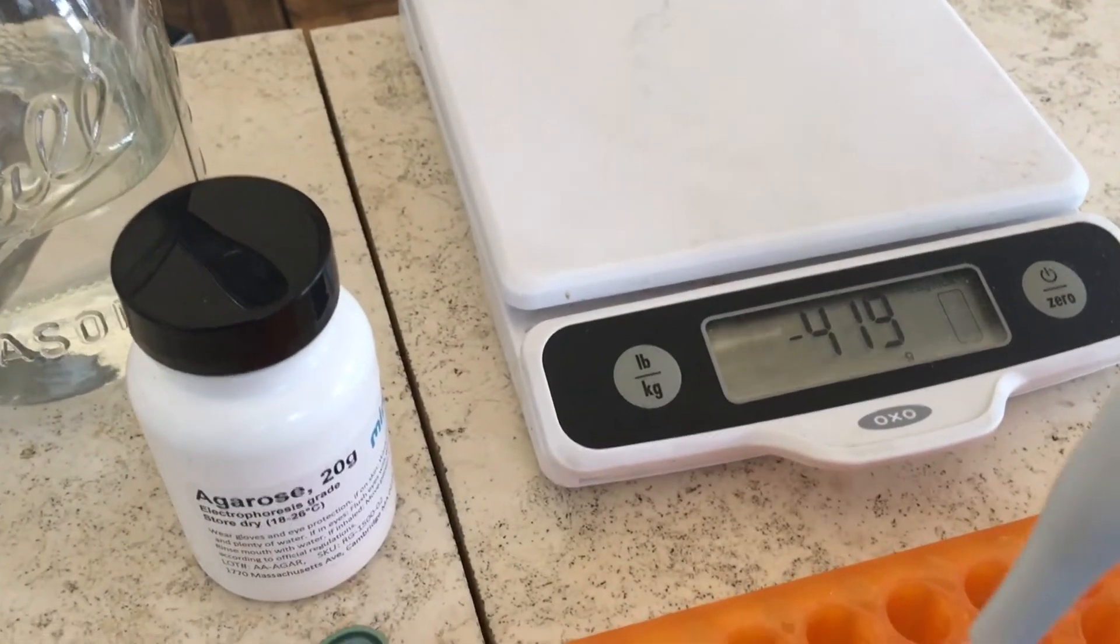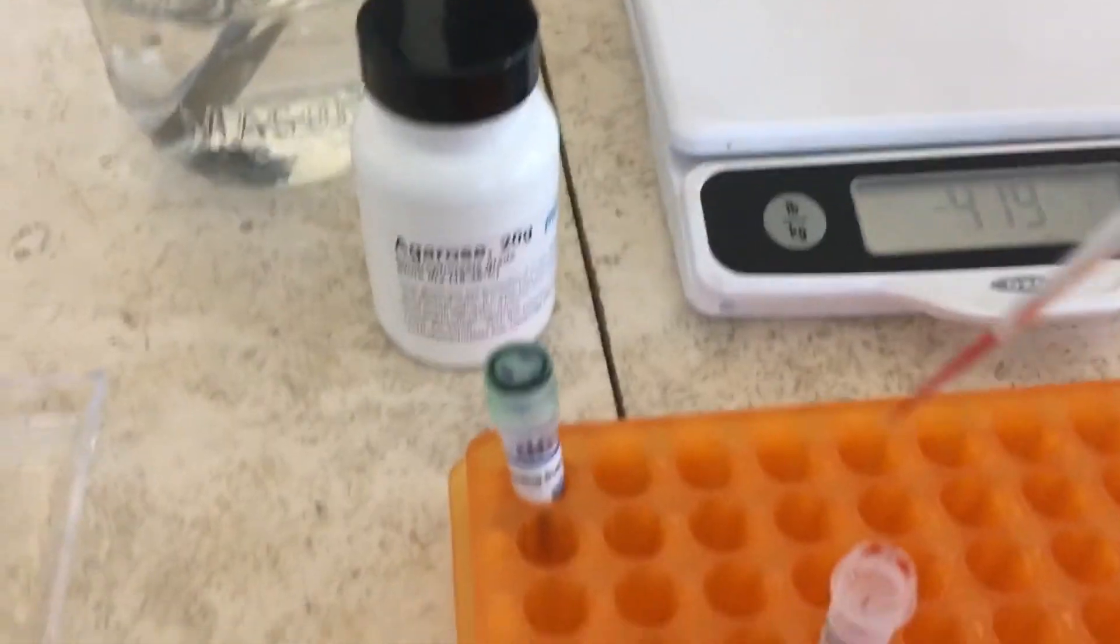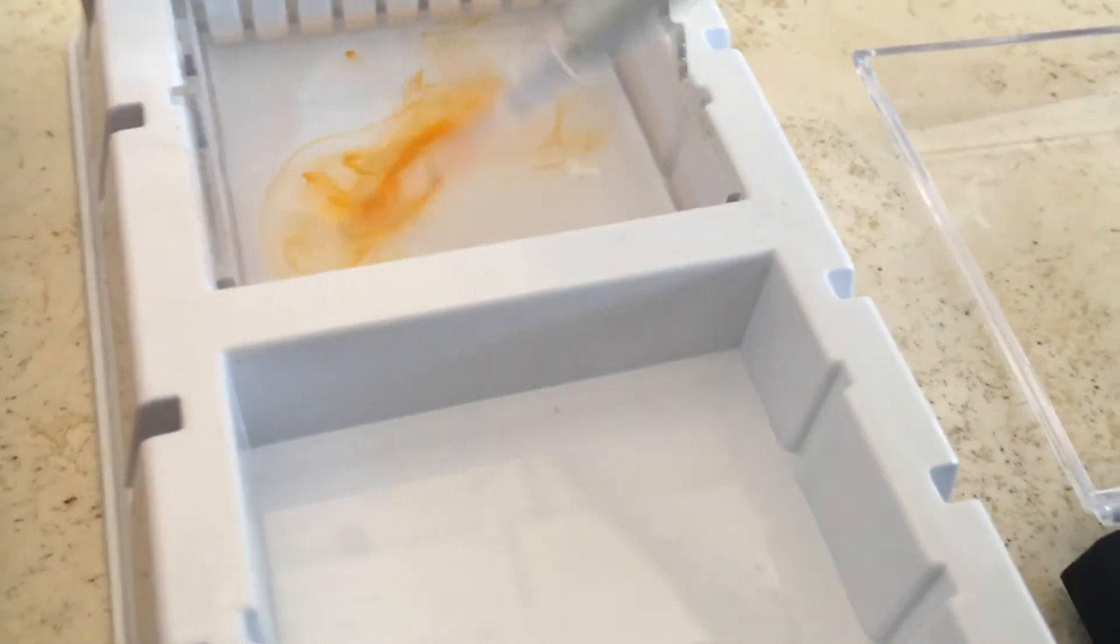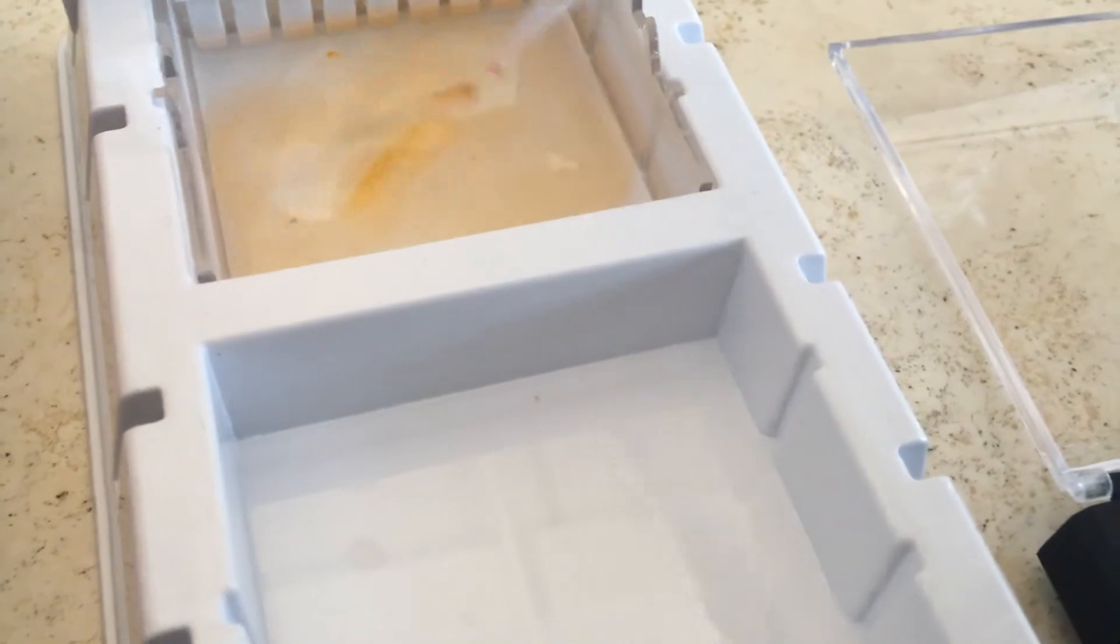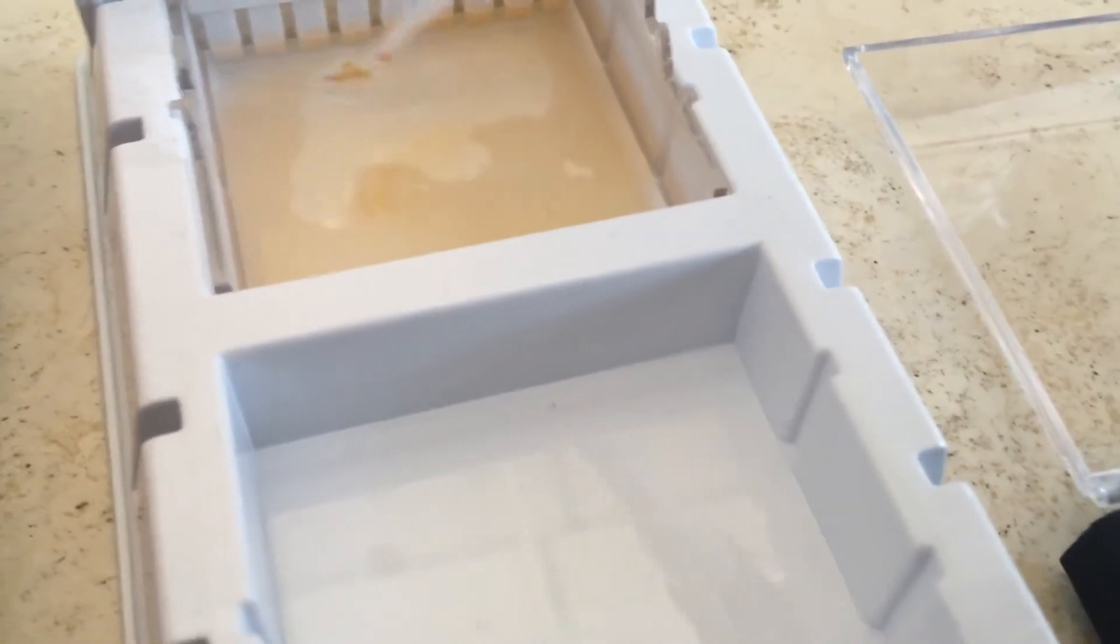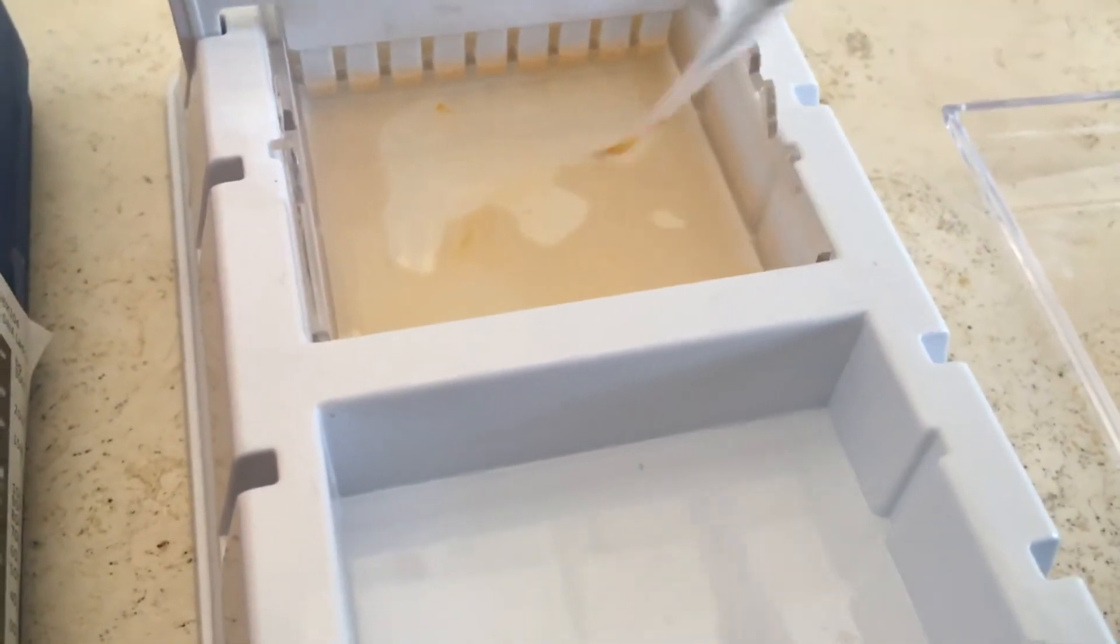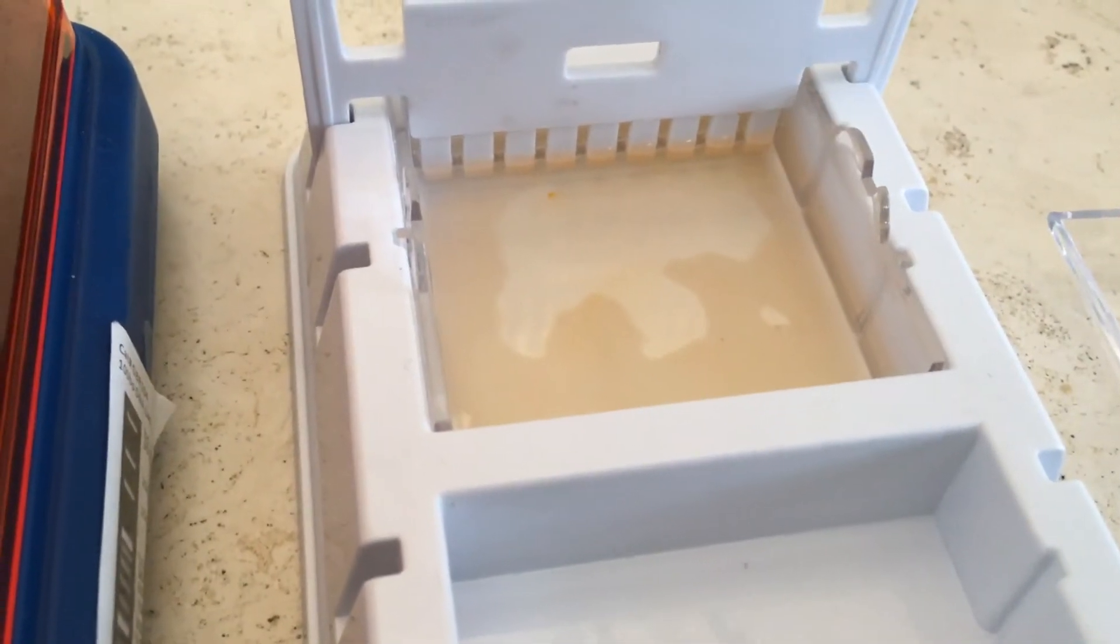So we're going to take about two microliters of the nucleic acid stain and we're going to mix it into the gel. It's still liquid. It hasn't formed a gel yet. So you just sort of blend it around and distribute it until the stain is fairly equally distributed. I call that good. So now we're just going to let it sit for about 10 minutes so it has a chance to set.